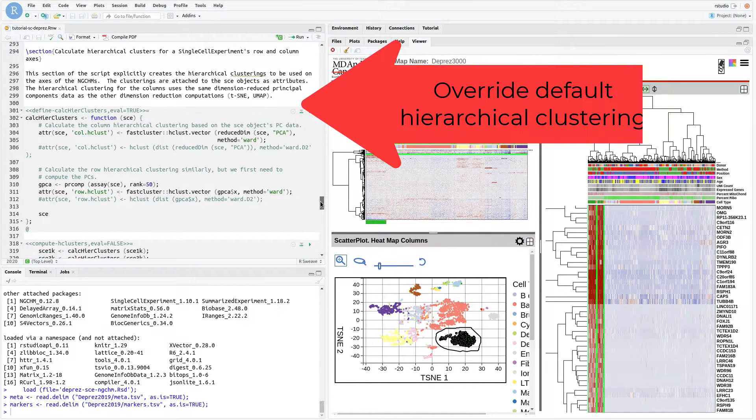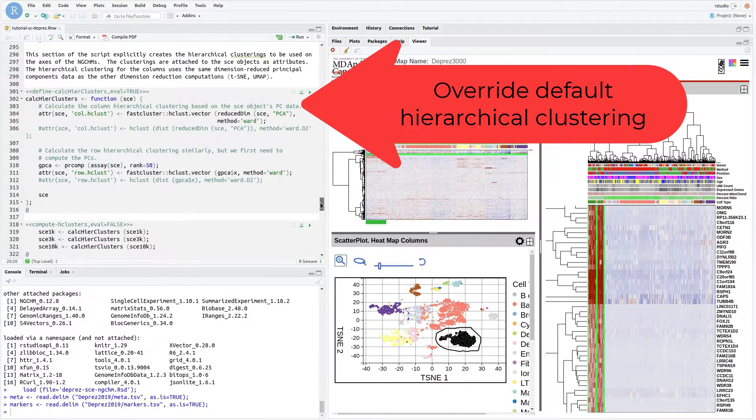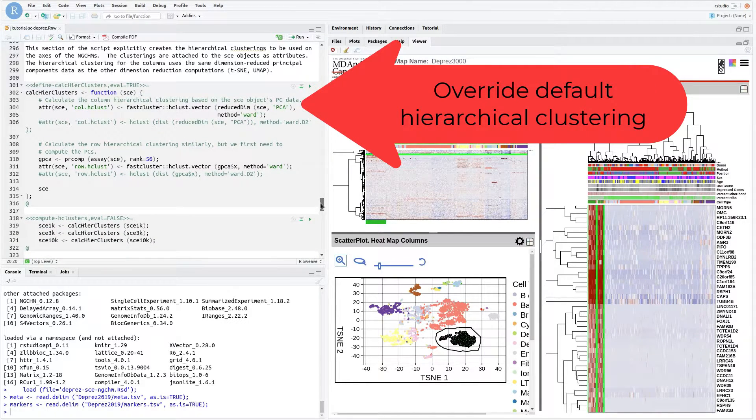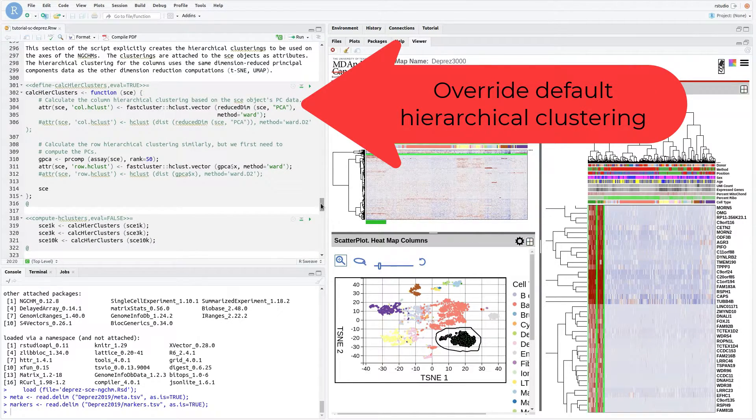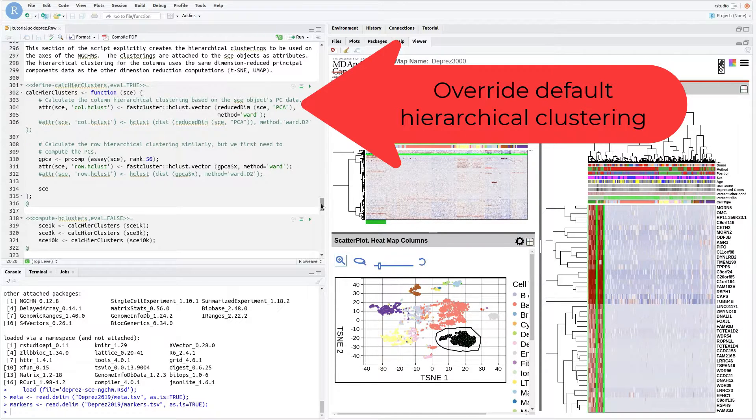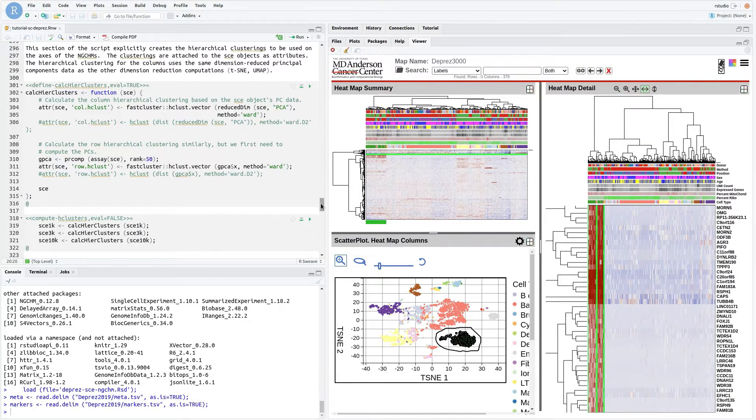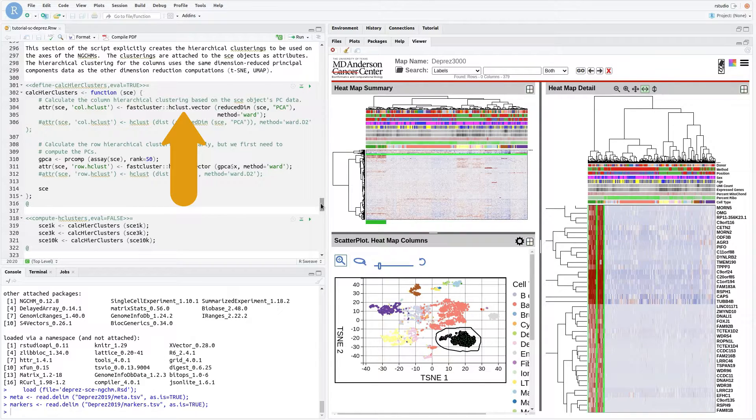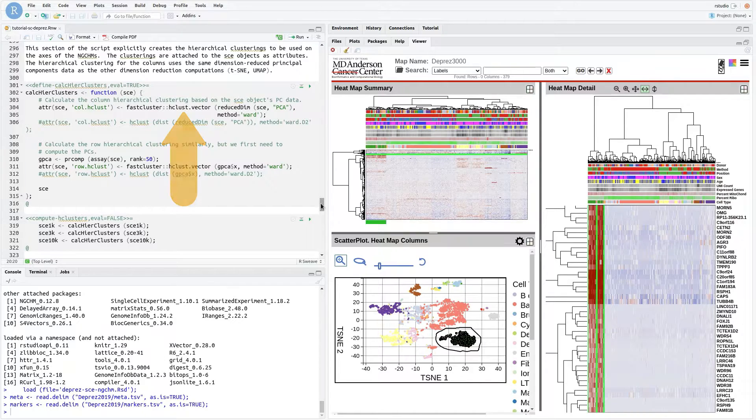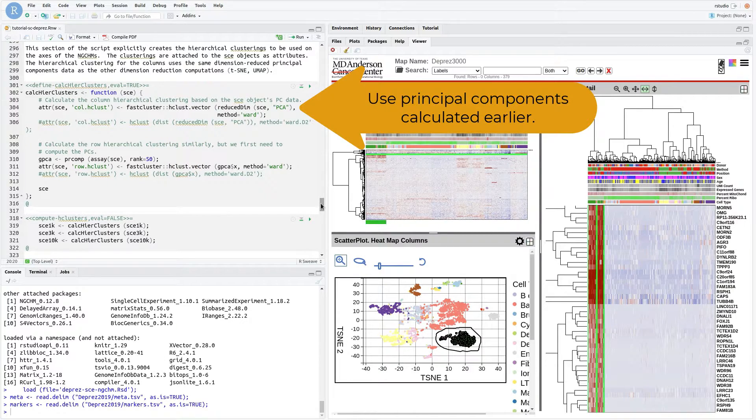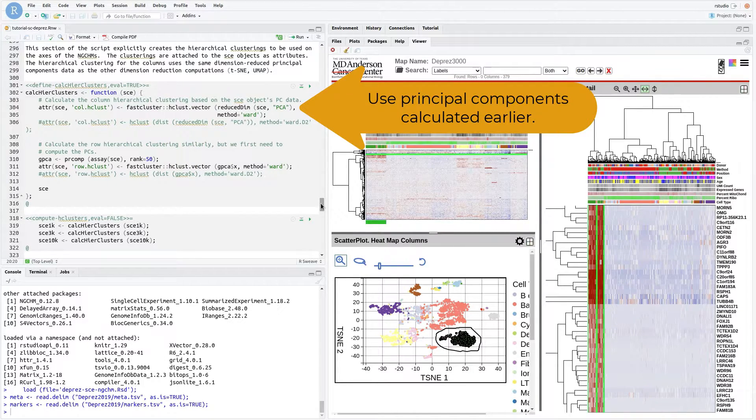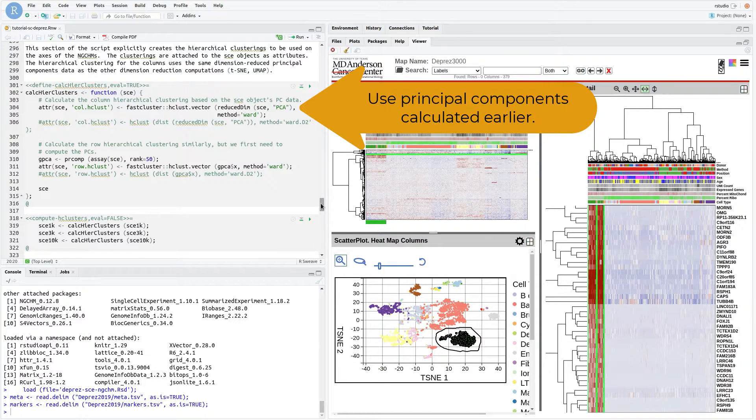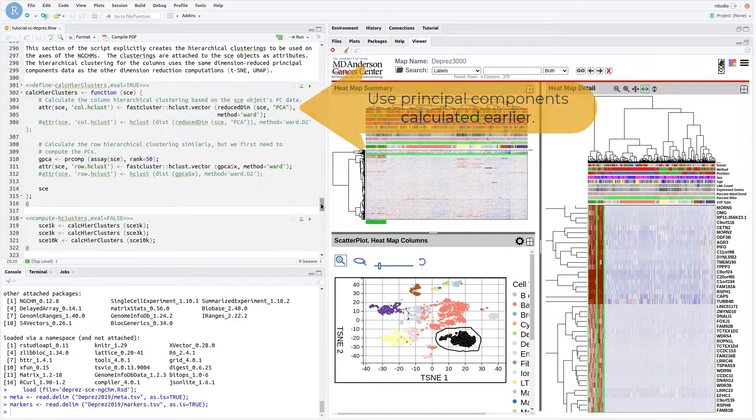The last preparatory step before creating the heatmaps is to generate hierarchical clusters to use instead of the default NGCHM clusters. To reduce the time and space required for clustering, the hclust.vector method from the FastCluster package is used. It is applied to the same reduced principal components data that was used to speed up the calculation of the UMAP and t-SNE coordinates.